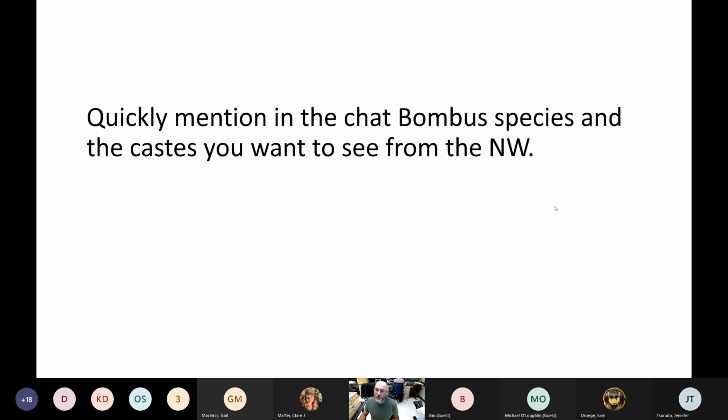Otherwise, I'm going to introduce some strategies for Western bumblebee identification, talk a little bit about some of the challenges, and then hopefully provide some strategies and solutions to work through those. And we will run a bunch of different bumblebee species under the microscope and try to use one or two primary resources to identify them. So off with the webcam. We do have 50 minutes or so, so let's go.